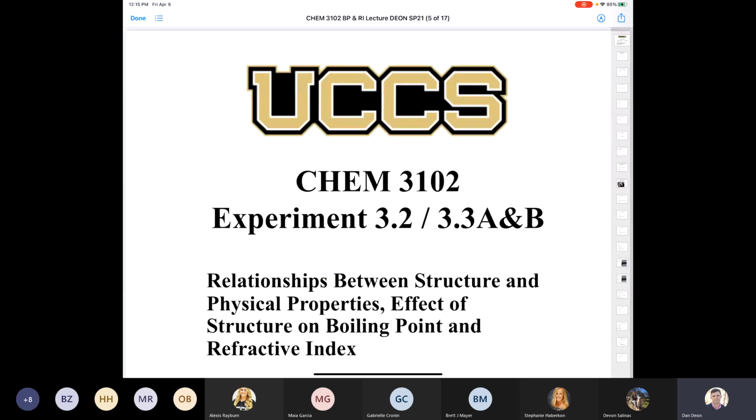Chemistry 3102. We're going to be talking about experiments 3.2 and 3.3. Keep in mind that for both of these experiments, you're going to be doing parts A and B. So 3.2, you're doing part A and B, and 3.3, you're doing part A and B.